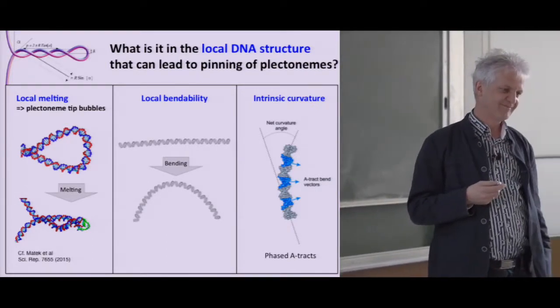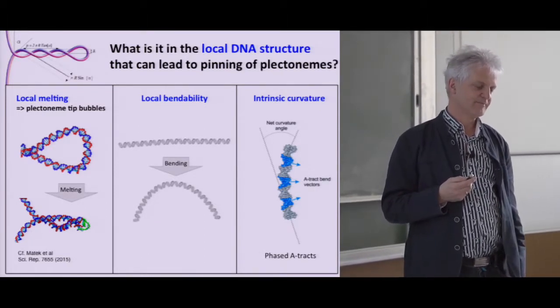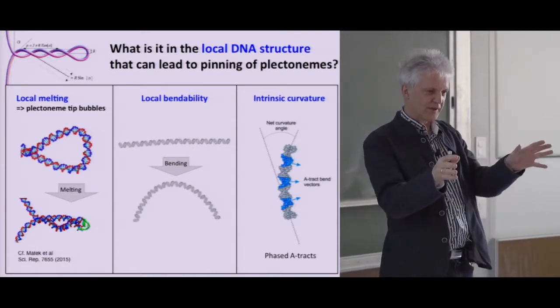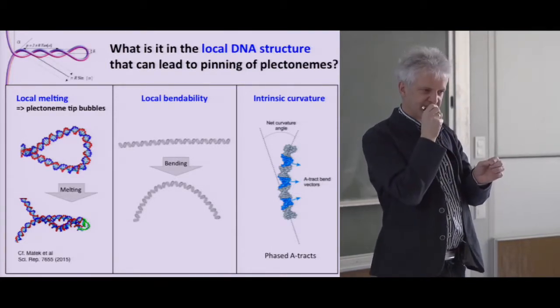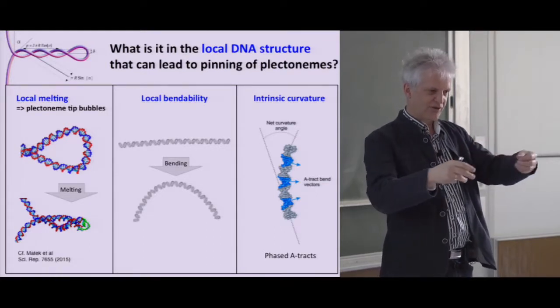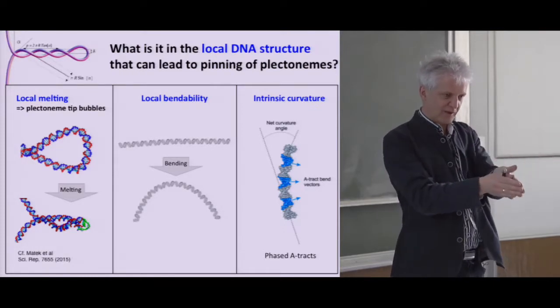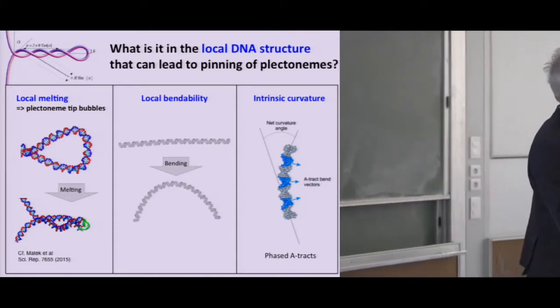Very quick question. You showed the density of these plectonemes. Does that incorporate that these plectonemes are also elongated? Do you take that into account? So when I show the density, because of the conversion we did from microns to kilobases, what I'm plotting there is the position of the tip. Regardless of how big we see the DNA density, which we then project into the plectoneme position. And indeed, if we find a 3 kb long plectoneme, we take the center of that structure as the position of the plectoneme. Right. Yeah. Yes. Sorry.